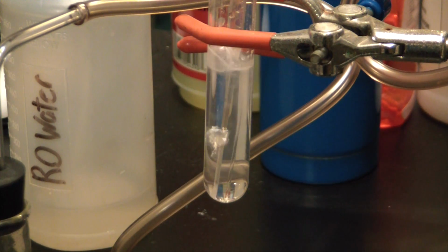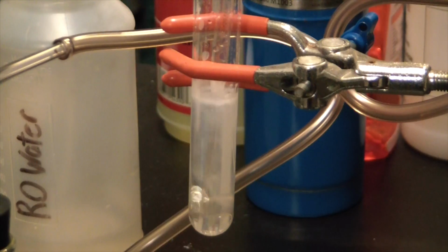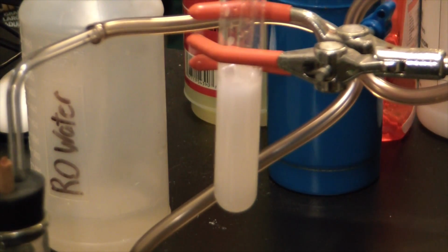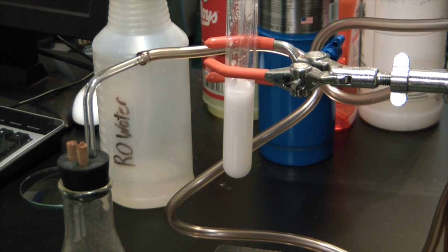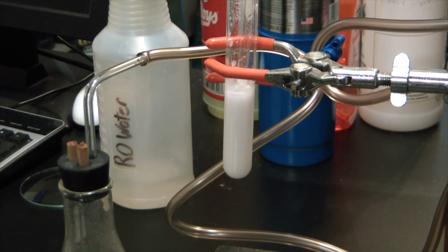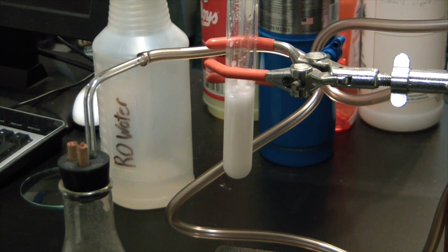Starting to see something happening. See, it's starting to look milky up at the top. That's our precipitate forming. The color of the solution actually indicates our silver purity was really good too, so that's pretty awesome.